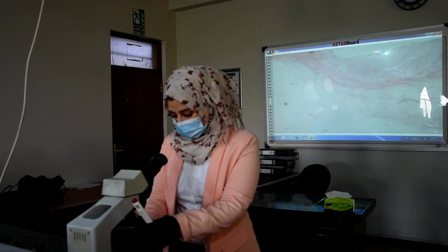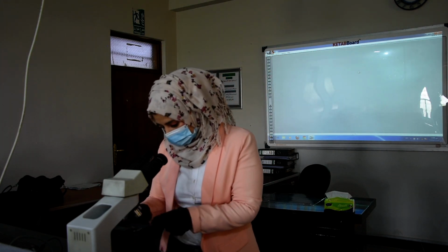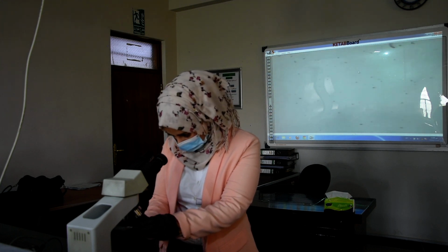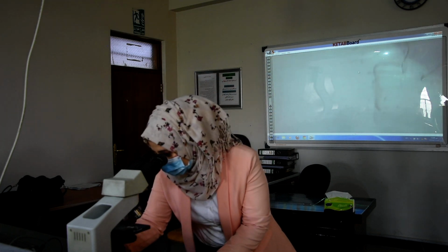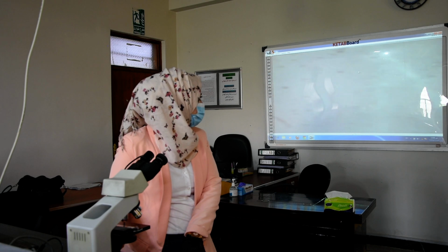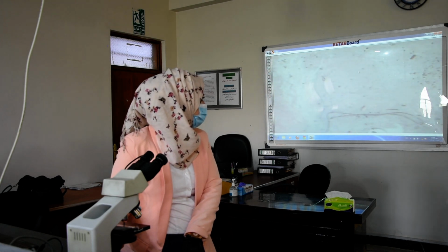Okay? Another slide. Also a section of cardiac muscle and epicardium.